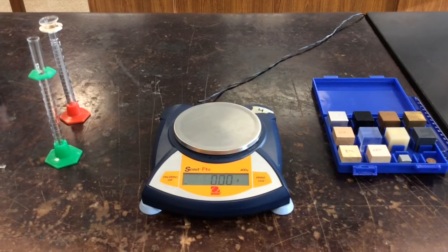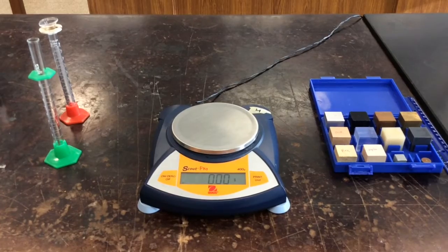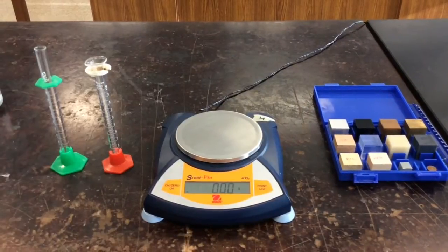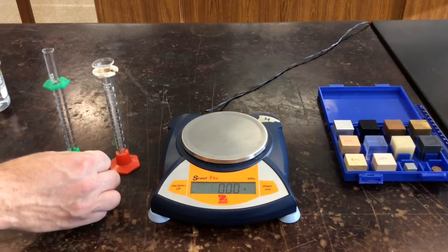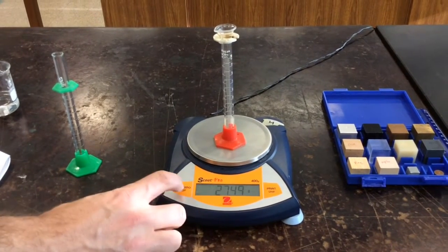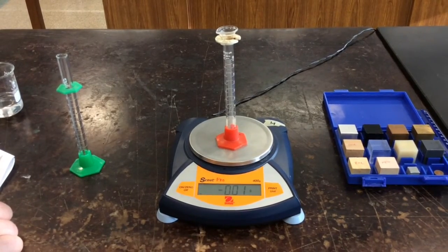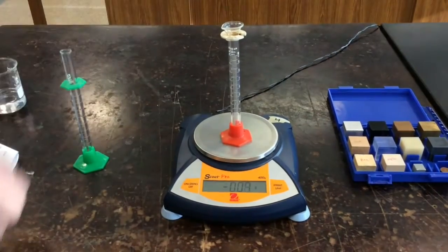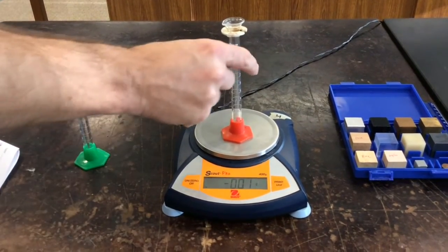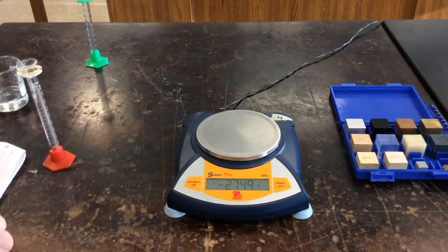All right, for the first procedure, we're going to be taking a look at the density of two different liquids. You will have two graduated cylinders, each 10 milliliters. First thing you will do is take one of the graduated cylinders, place that on the balance, and hit the re-zero button. The balance should say 0. Now any little bit of air moving over the balance, you'll see it will move up and down. They're very sensitive. As you take that off, you'll notice that the balance goes to a negative number. That's actually the mass of your graduated cylinder.